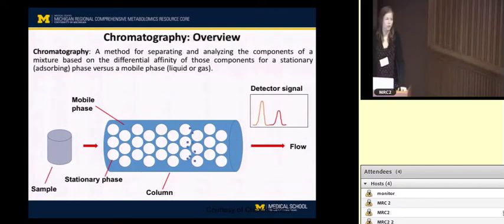And molecules that have a strong affinity to the stationary phase are going to be strongly retained and are going to appear late in the chromatogram. So based on the time it takes each individual analyte to be detected, we can already get some idea of the chemical properties, because we know that it must be a property that gives them a high affinity to the stationary phase.